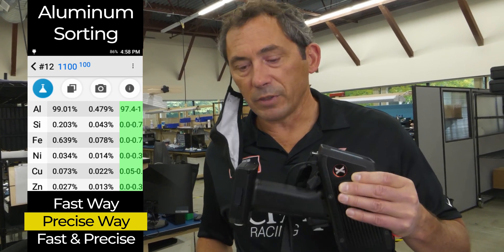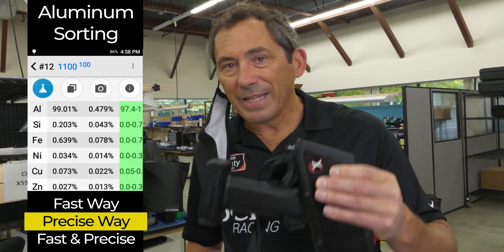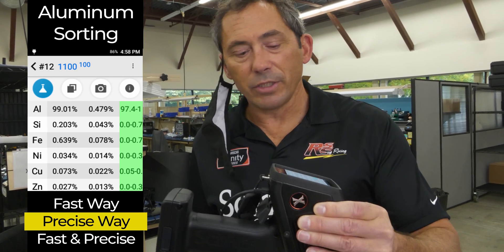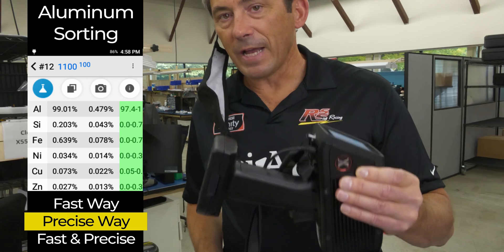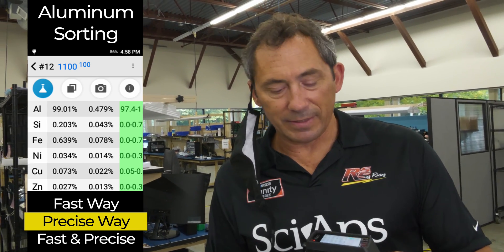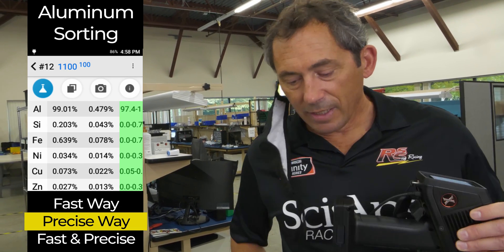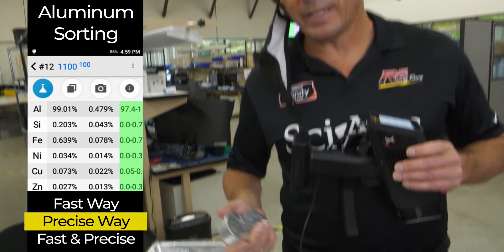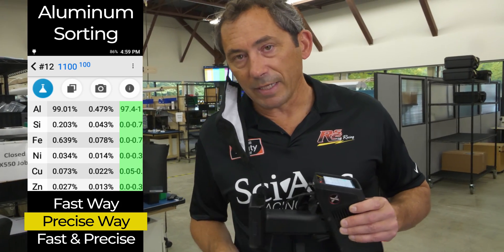One of the real innovations, besides the small size and weight of this analyzer, is that we've been in the x-ray business for 20-plus years and we designed this device to really measure magnesium fast. People used to hate measuring magnesium with x-ray guns because it took like 30 seconds or longer to see the 1% mag in a 6061. Now we're doing that in one or two seconds — it's really pain free. So if you have stuff like this, take the extra second or two and sort these out by measuring the magnesium and the silicon.